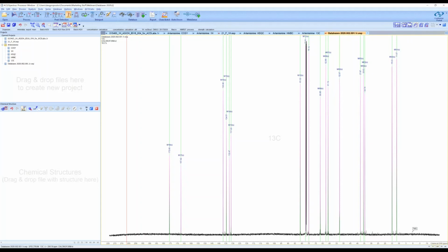So imagine, for example, that you are doing metabolite analysis and you have your starting API, and you know what the possible metabolites are, and you have isolated some, but you definitely don't have reference spectra for all the possible metabolites. You have, though, their structures. So you could predict the spectra for these possible structures, and then use the experimental results that you have and search these possible spectra to see if any of the metabolites you expected is the one that you have isolated.